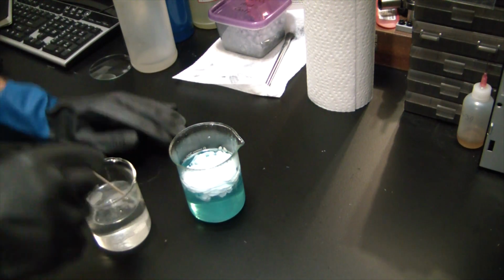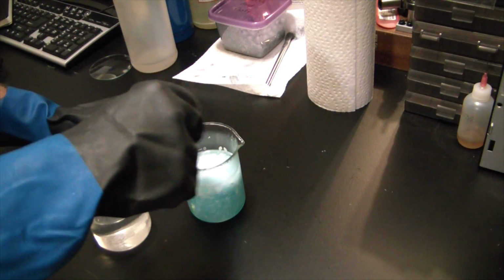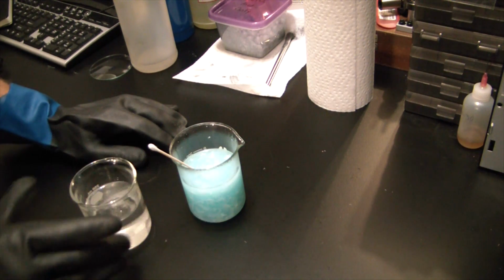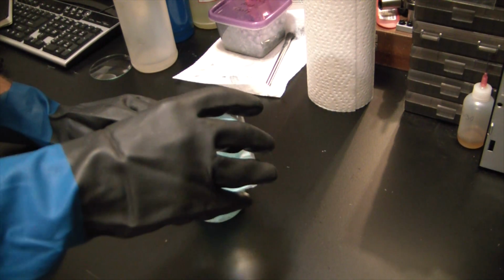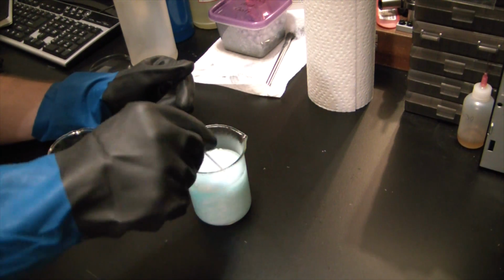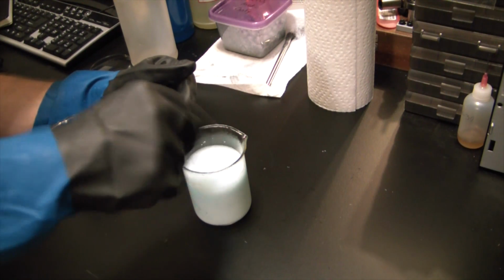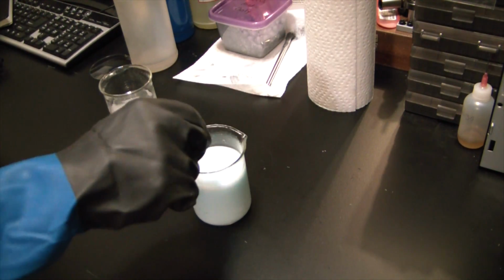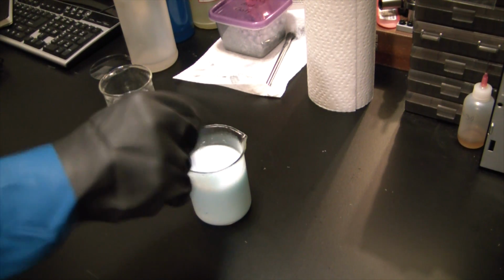So that milky precipitate you see there, that is silver chloride. And we'll know when to stop adding the sodium chloride solution, because it'll just begin dissolving into solution and no longer forming this precipitate. That is a thick mass of silver chloride.